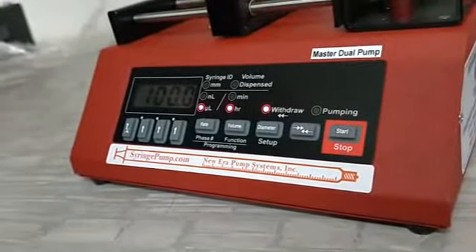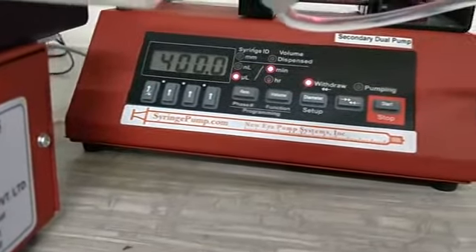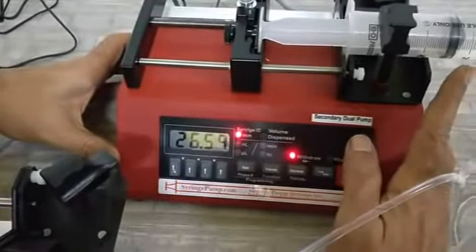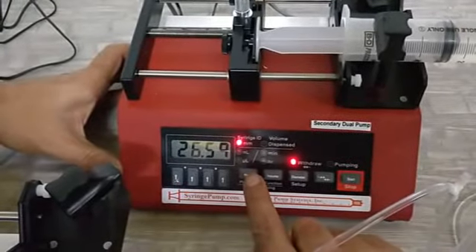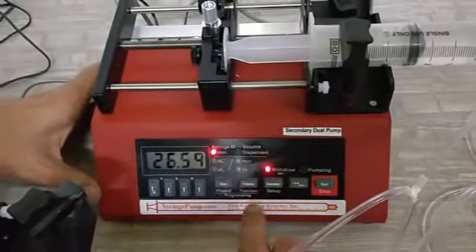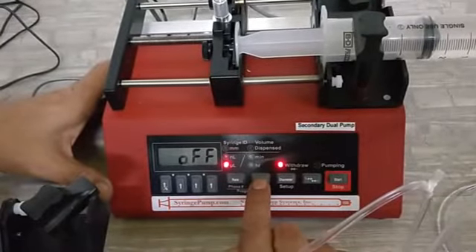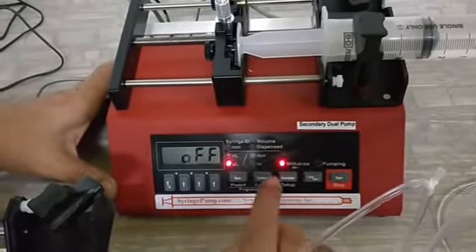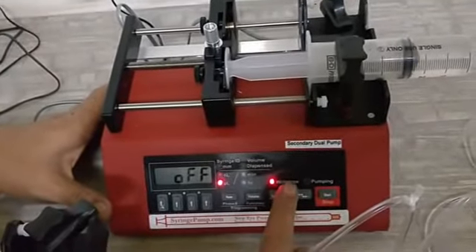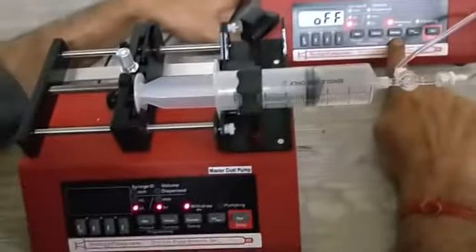The next step is to configure the secondary pump. We need to give it the diameter. This syringe is a BD 50 ml syringe, so the diameter is 26.59 mm. Then set the volume — make sure that the volume on the secondary pump is set to 0, which means it is off. Also make sure that the secondary pump is in the withdraw mode at the start. Once it is in withdraw mode and dual mode begins, the master will start in infusion mode and the secondary will start in withdraw mode.